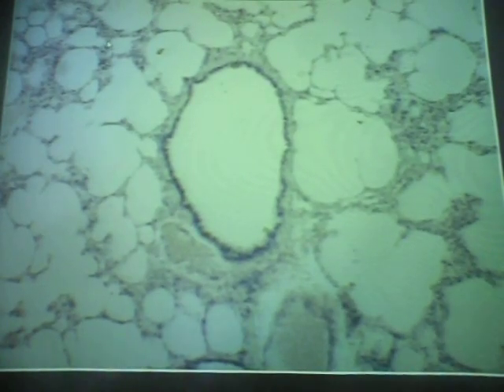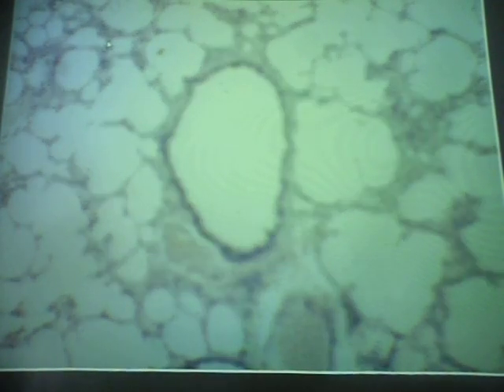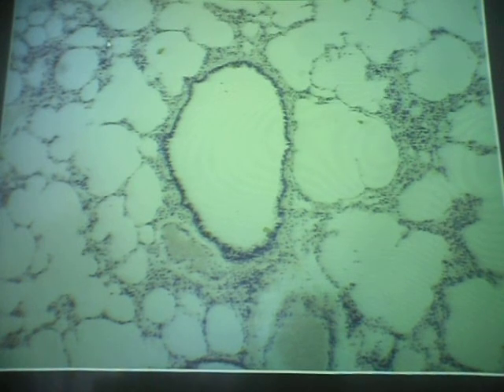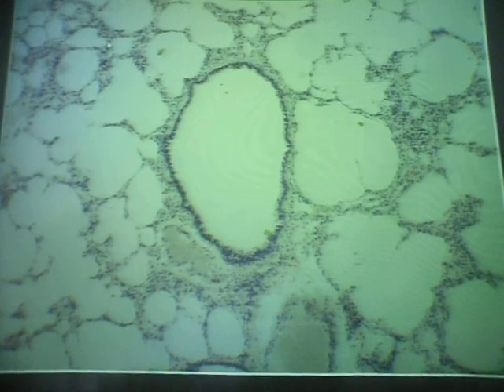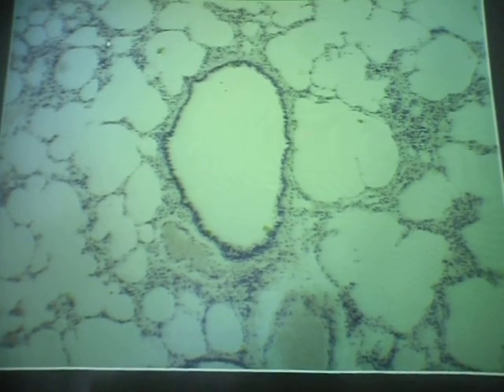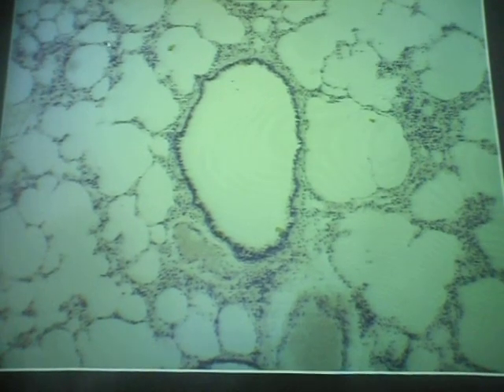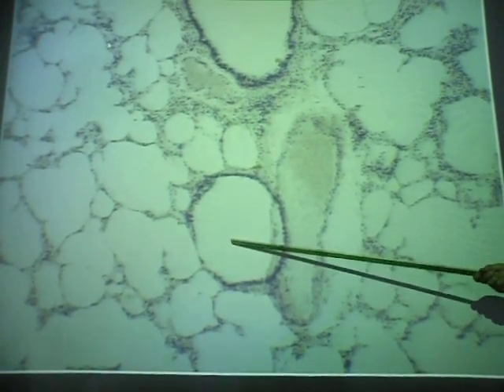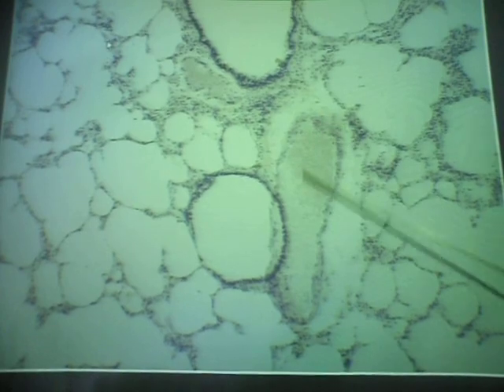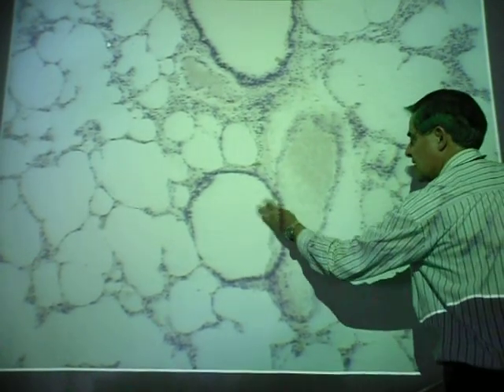Okay. And here'd be another one. Tertiary? No cartilage. That's a blood vessel there. Oh. Okay. So this would make it a bronchiole. Okay. And here, how about this one right here? What would this be? This is a blood vessel. Kind of folded, the tissue's folded, that's why it looks like it's superimposed.